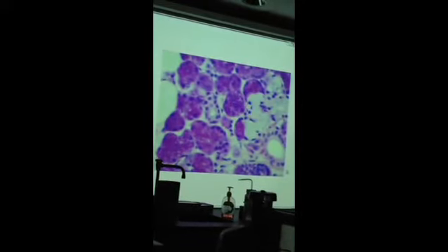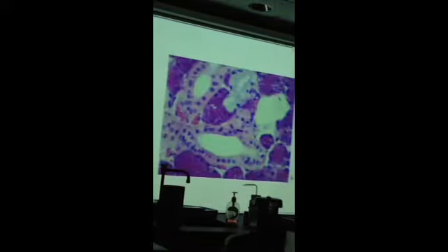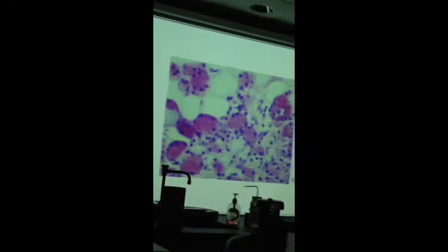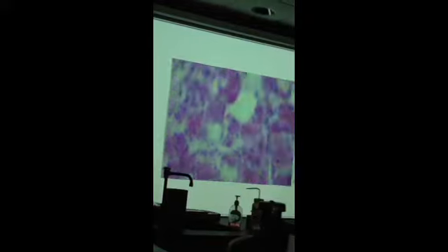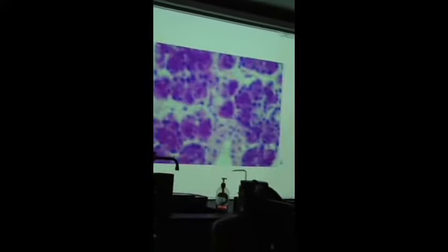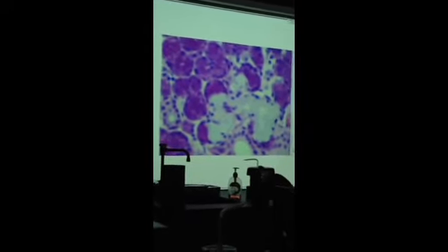Okay, there's also something else you may not have recognized on these slides. Some of the serous cells form a crescent-shaped cap over the mucous cells. And that fancy name is serous demilunes, and that's on your handout. Serous demilunes, which means like a partial moon. They're kind of crescent-shaped.